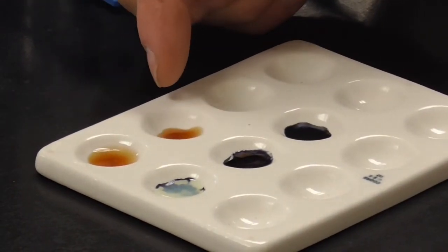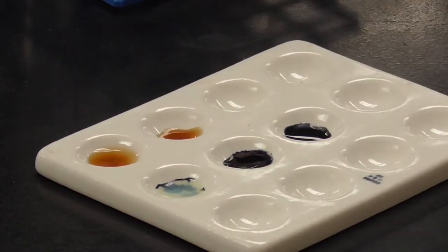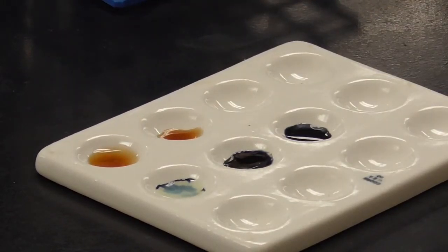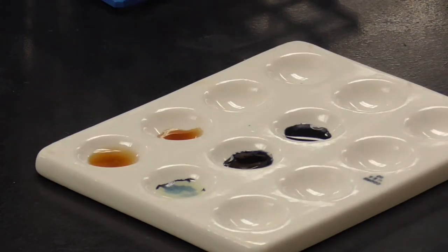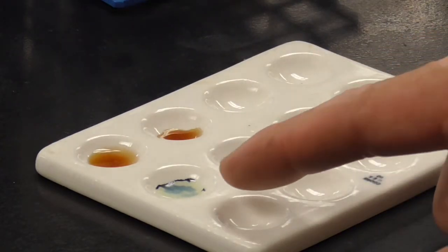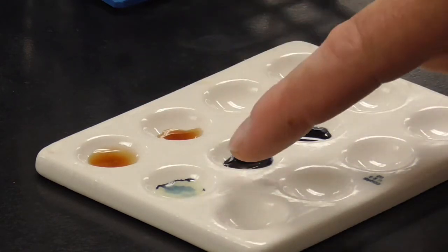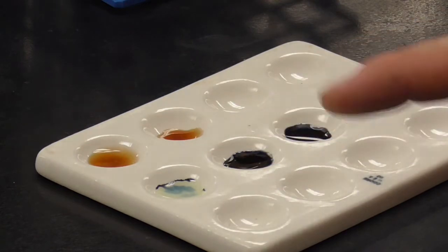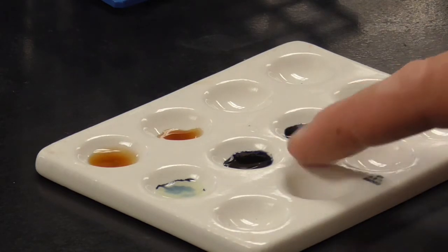Sodium chloride, ethanol. Might surprise you, actually, what inhibits and what doesn't, but those definitely look like they were working, right? Then we had the silver. Looks like there was a side reaction happening to the silver, but I certainly don't have that color. In fact, I got the dark blue color as well. So I would call that dark blue, and there's a side reaction creating this creamy thing as well. And then these are clearly very dark blue.